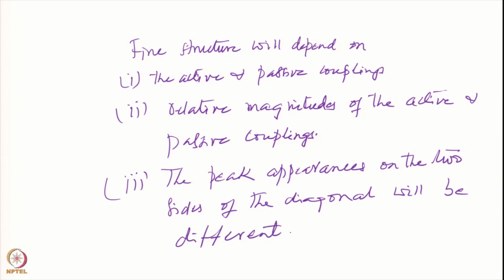Okay. So, these are the important features of COSY and double quantum filtered COSY spectra.